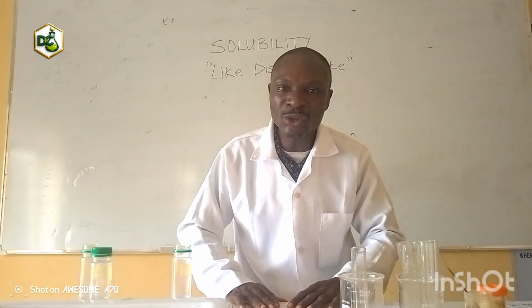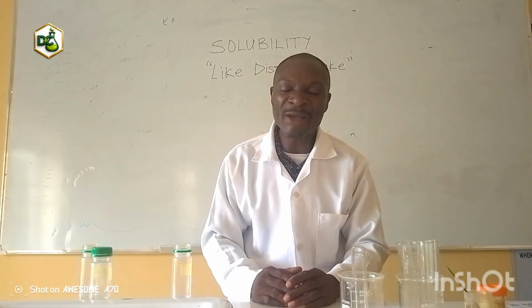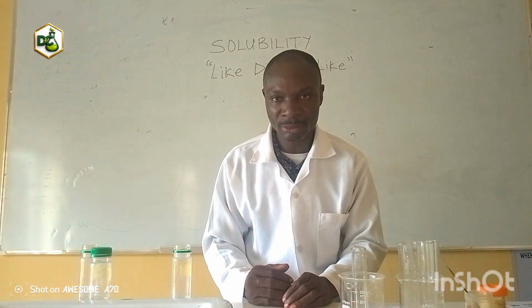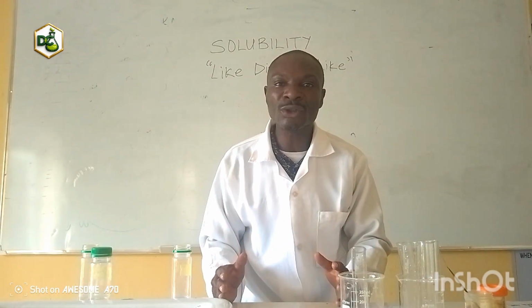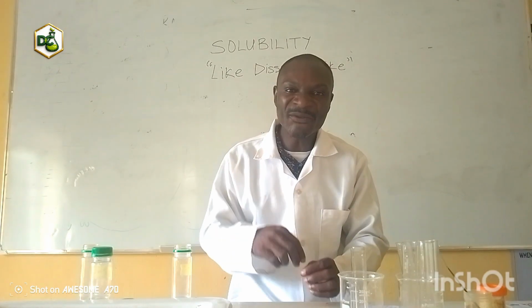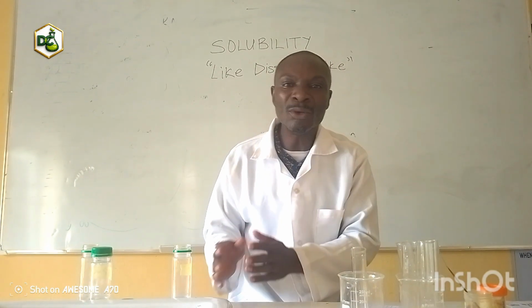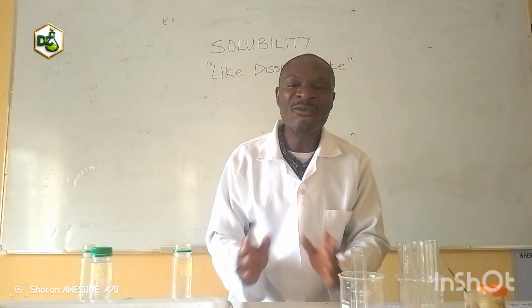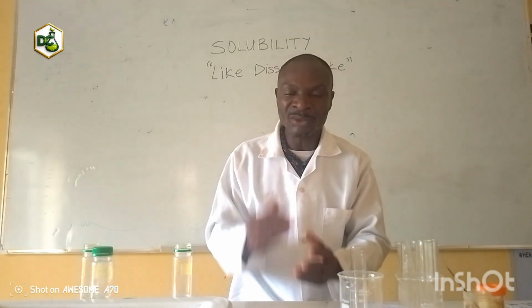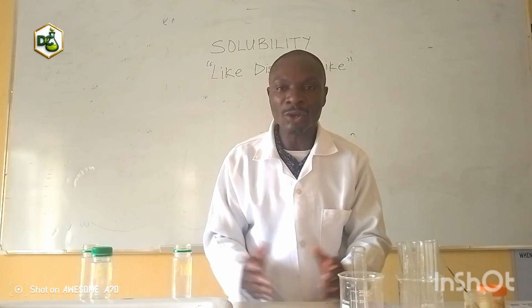It is soluble, but you added excess of the solutes. That's why it's appearing. Those particles are still found in that mixture. So in carrying out solubility tests, as in just to test if a given substance is dissolved in another, or a given liquid is miscible in another, just add a very little. Don't add much, so that you observe to know if that little you added dissolved or not.